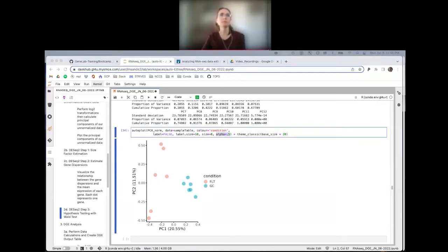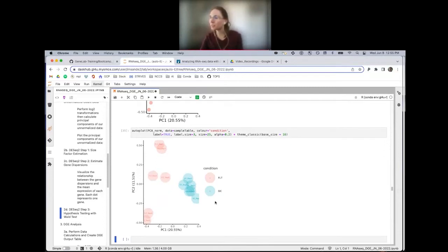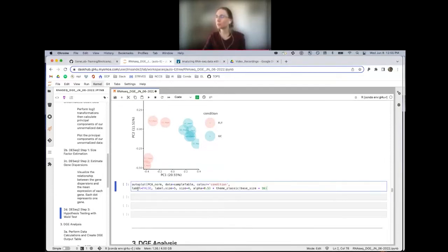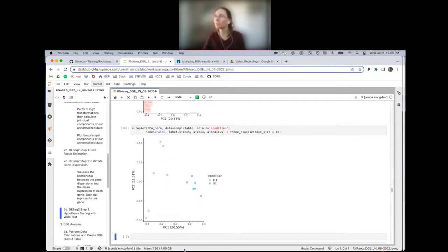Nice. All right, what about this one here? Here's another one where size is 25 and alpha is 0.2. Oh, and they're labeled. Oh, this is so cute. I really like this. They're like bubbles with names in them. Never seen anything like that before. Very nice. All right, one more here. Smaller size and alpha of 0.5. Very nice and tidy little points that are see-through. Very nice.